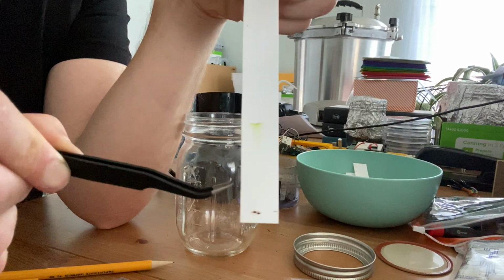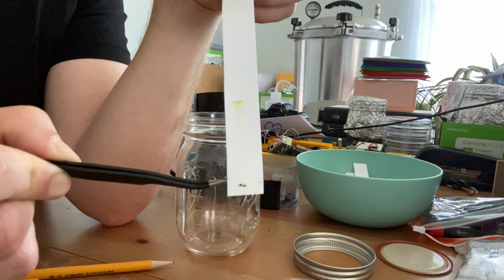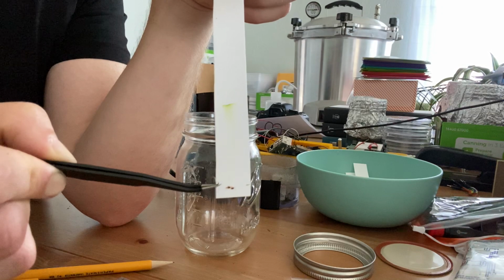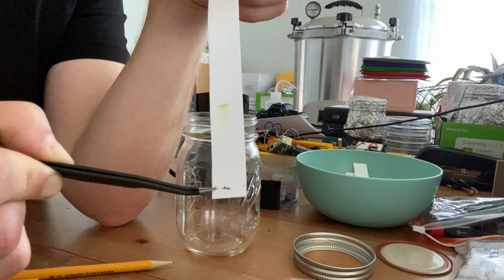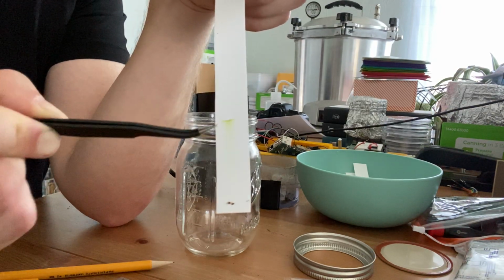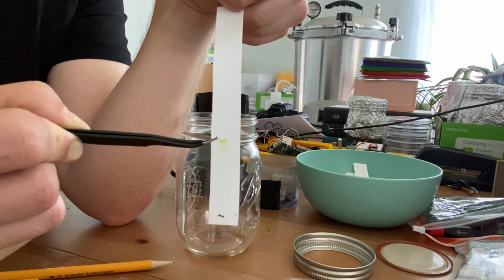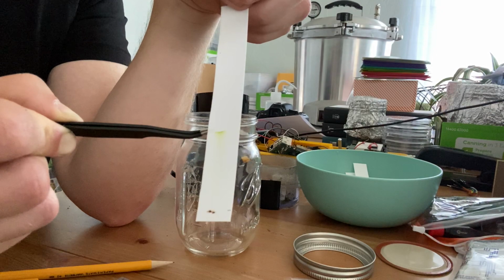So now, to calculate the retardation factor, which is how slow or fast it is moving up here: if we wanted to determine what this particular compound is that caused this really dark green spot here, we would measure the total distance that this particular compound traveled divided by the total distance that the mobile phase, the solvent, traveled up here. Now, I probably made a mistake here because this demarcation is darkest right at the solvent front. So it would have an Rf of 1. And I don't know that that tells us a whole lot. But that's the central idea of this.